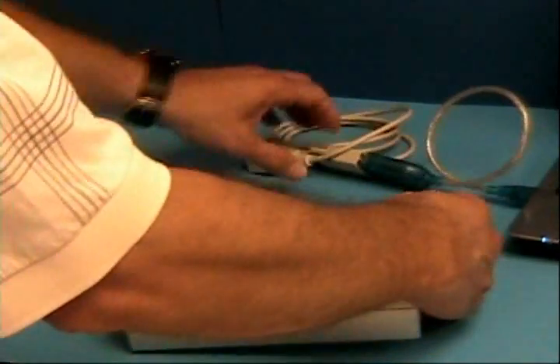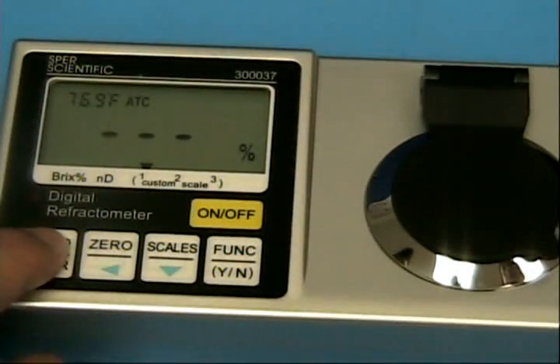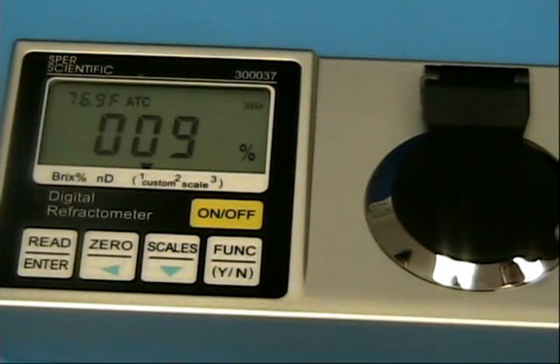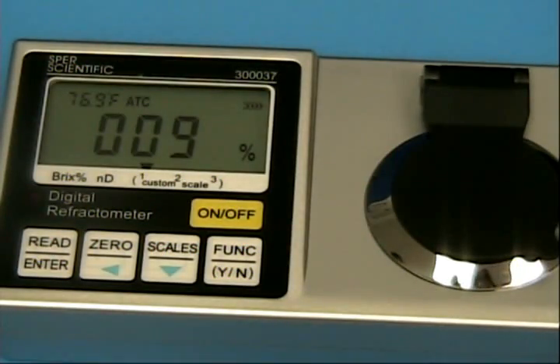We've put the sodium chloride scale we created in position number one, and now we're reading percent sodium chloride.